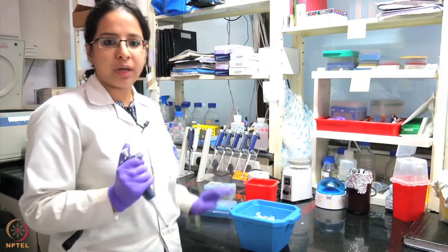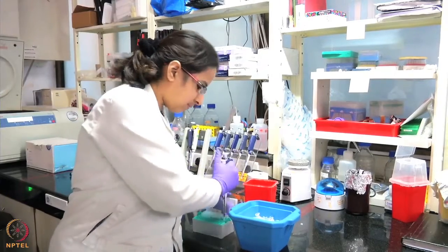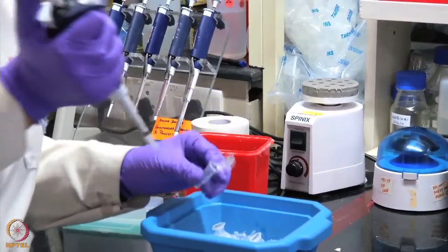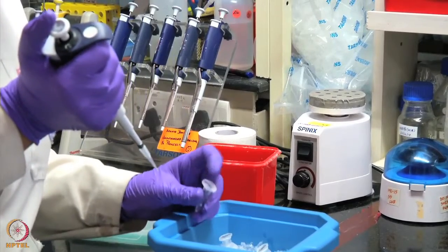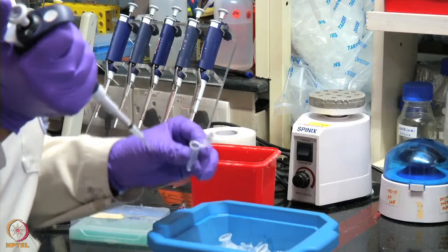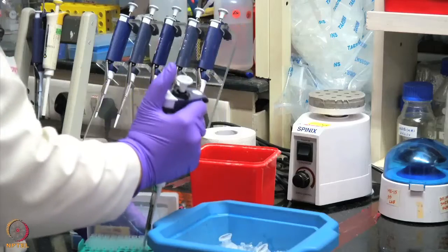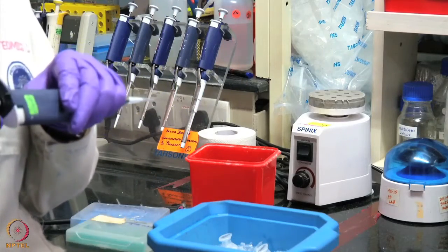Right now I am carrying out restriction digestion for the insert. So this is the insert. I'm going to add the restriction buffer.